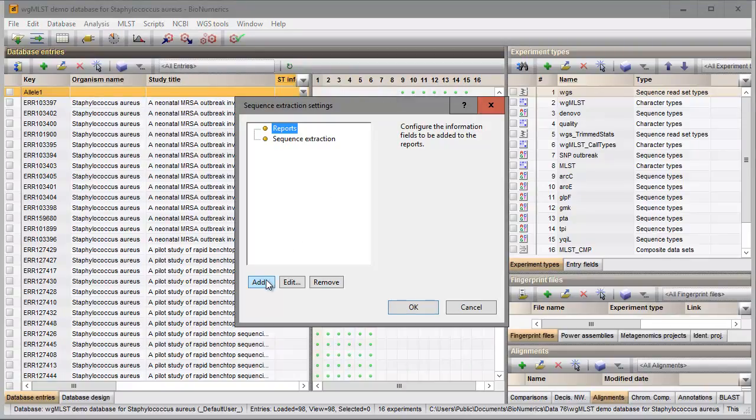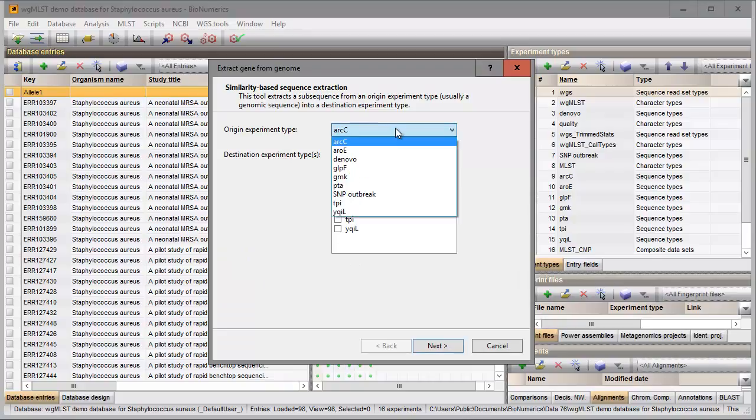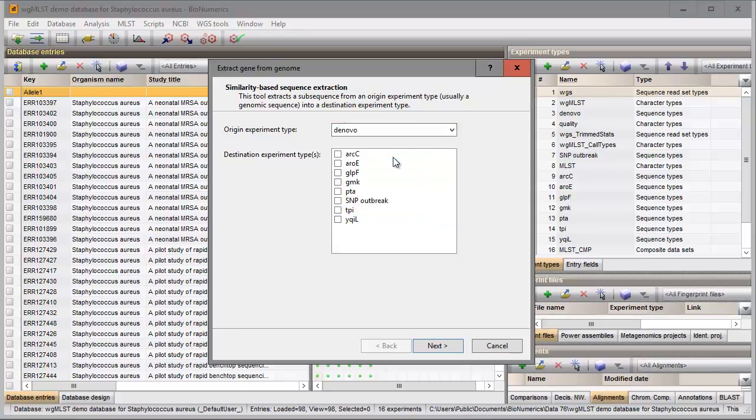I press the add button and select de novo as my origin experiment type. This experiment contains the whole genome sequences that will be used for the screening. I will check all seven housekeeping gene experiments for the storage of the extracted sequences.